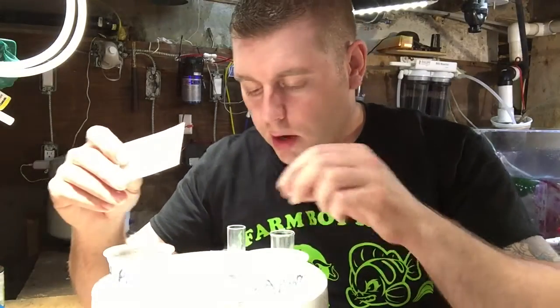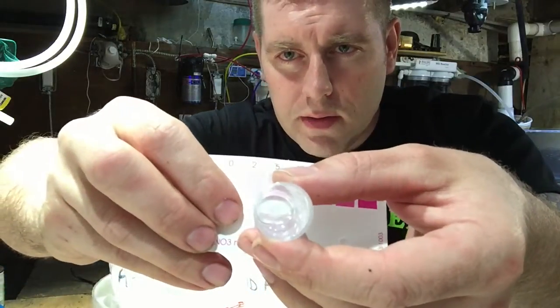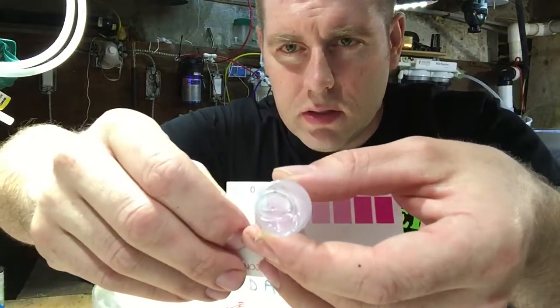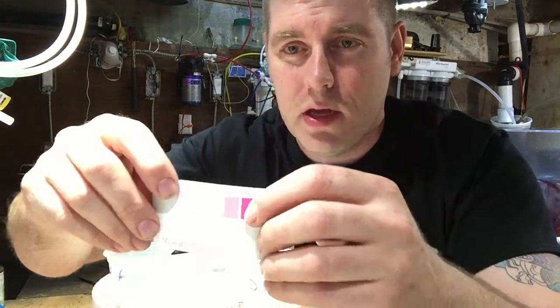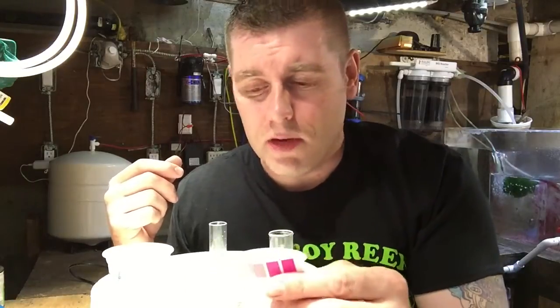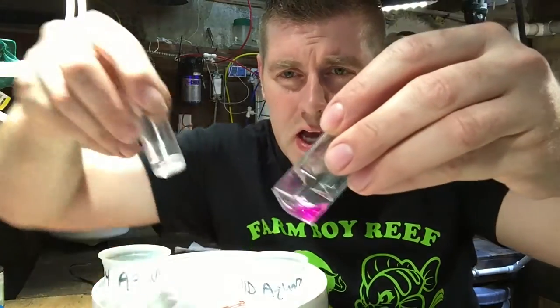Now let's grab my tank water — the other test vial, taken just tonight. It's a lot clearer. Looking through it, it's a little pink. I think I'm about two, maybe between two and five — looks more like two parts per million. That's a pretty simple test and that's all there is to it. If you're at a hundred or fifty, you better get some water changes going because invertebrates do not like nitrate in the tank.